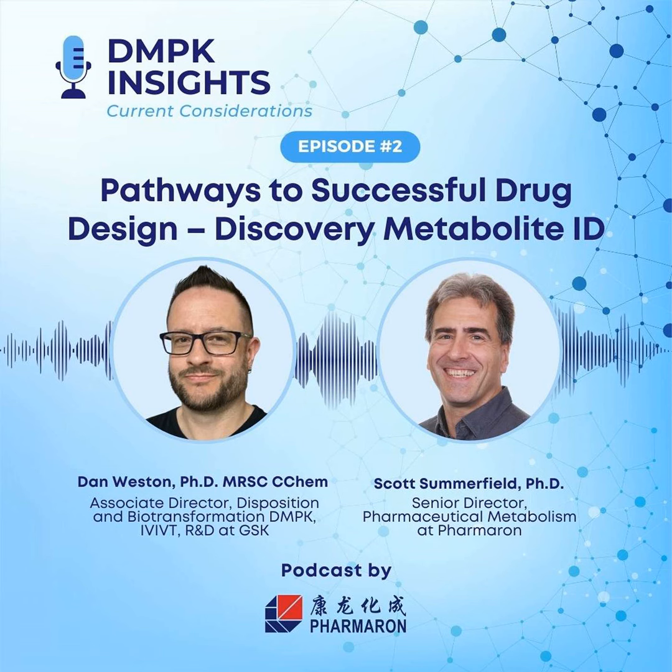That's something that I think we've been aware of as a community for a long time. And when software was in its infancy, decades ago, I was one of those people who worried about that. I think software has become much more intelligent, much more useful and relevant to biotransformation.